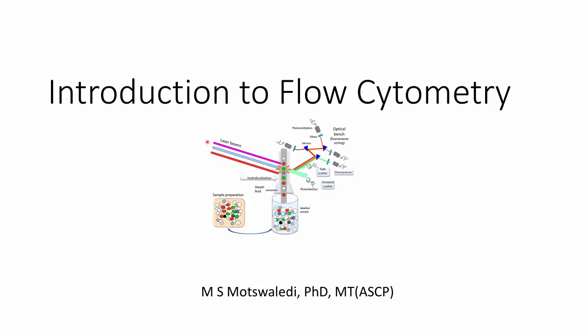Welcome to our first presentation on flow cytometry. In this unit, we will discuss the components of a flow cytometer. We will also cover general principles of flow cytometry and look at some cases in hematology to appreciate its application.